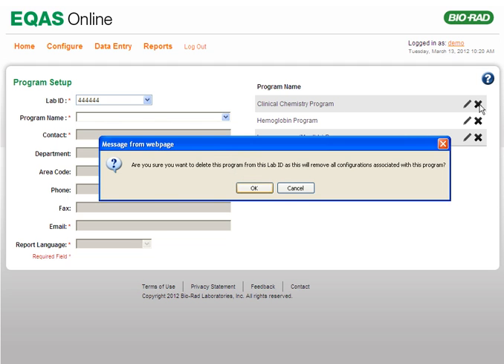A message box warning you that this action will delete all results and related configuration in eQAS Online and from eQAS Reports is displayed. The message box prompts you to confirm the deletion of the program. Click the OK button to confirm.